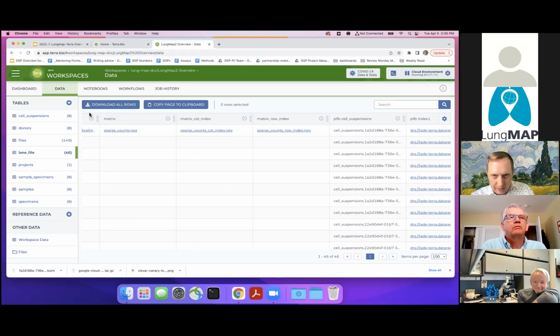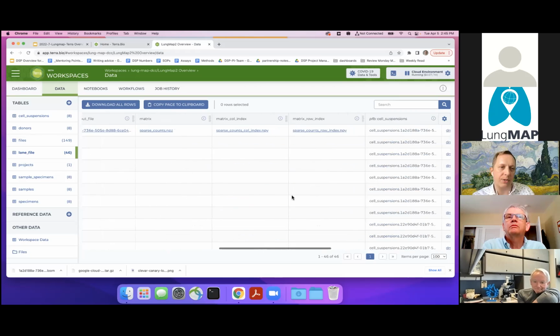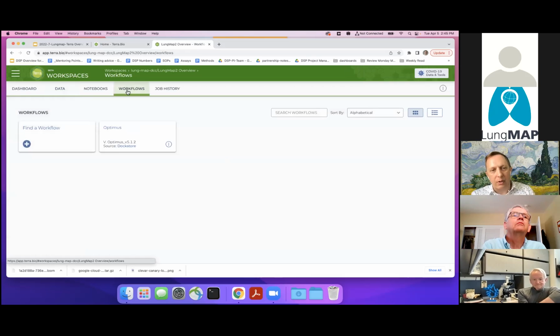Now, that's great. So I've made this stuff here. What does it look like to run a workflow? All right. And once again, a lot of this is a Martha Stewart cooking show, but hopefully this is still giving you a sense of how things work. And so as far as workflows go, I have one already added here, but to give you a quick sense of what it looks like when people are adding things.